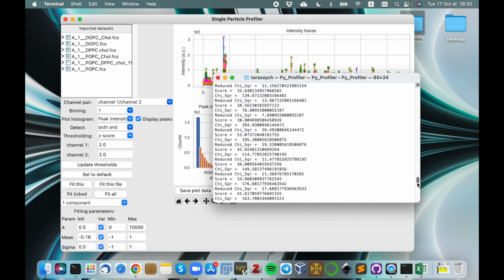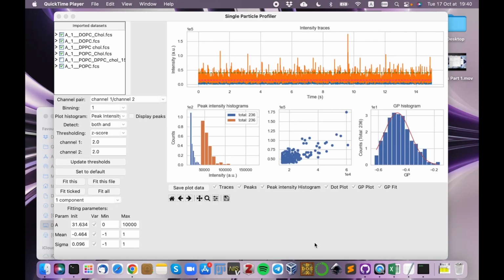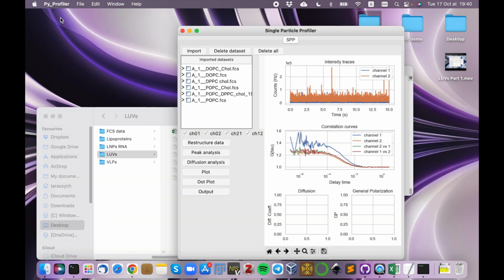Right now you can see your fit; for every fitting it will display this. So now, when the fitting is completed, I would like to show how to export the data of this fitting for every repetition, for every file. As I said before, this one we didn't fit, so this we can close now.